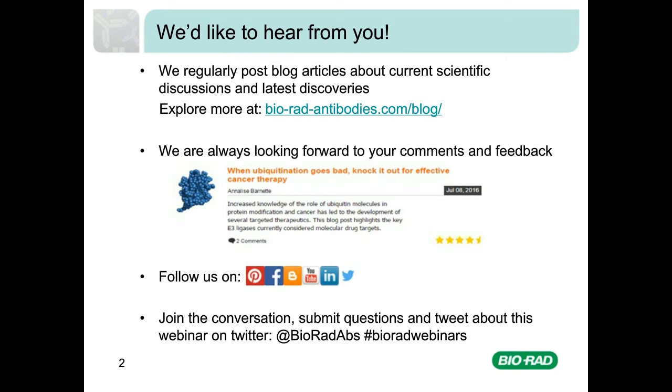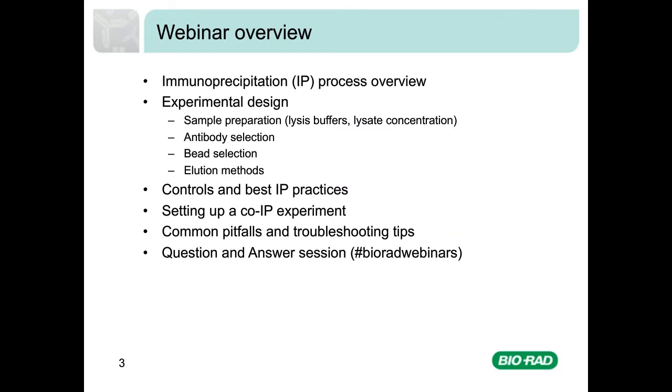Hello, everybody. So what topics will we be covering in today's webinar? There will be a quick introduction in which we will discuss what an IP is and what researchers are trying to achieve by performing IP experiments. I will also provide an overview of a basic and representative IP protocol.